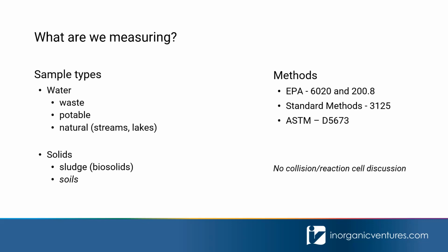I do want to mention right now that we're not going to be discussing collision or reaction cell technologies. The reason is that the instrument manufacturers have a number of different approaches to these technologies. And when you start looking at the details of the individual approaches and specific applications, it gets a little messy. If you have questions about that, we'd be happy to talk about it in greater detail, but we'll save that for after this particular presentation.